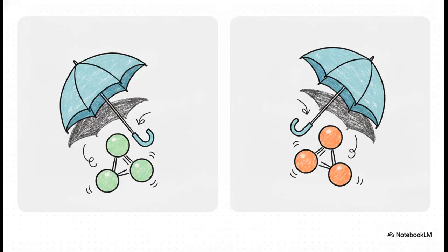So why does this little math trick work? It all comes down to the molecule's preferred conformation and the phenyl ring acting like a giant magnetic umbrella. Mosher figured out that when the molecule locks into its preferred coplanar geometry, that big phenyl group casts a magnetic shadow, a shielding effect. In the R-MTPA ester, the umbrella shields the L2 position. In the S-MTPA ester, the geometry flips, and the umbrella shields the L1 position instead.